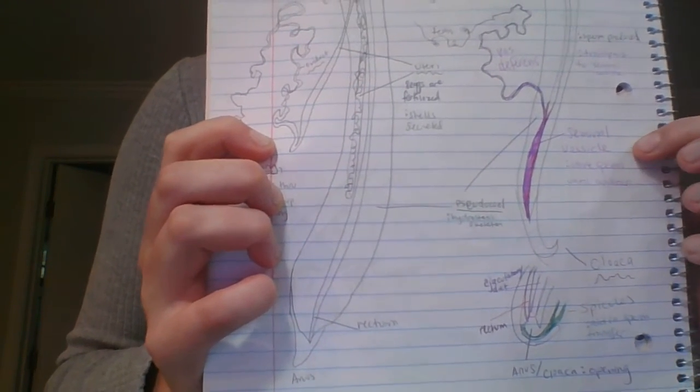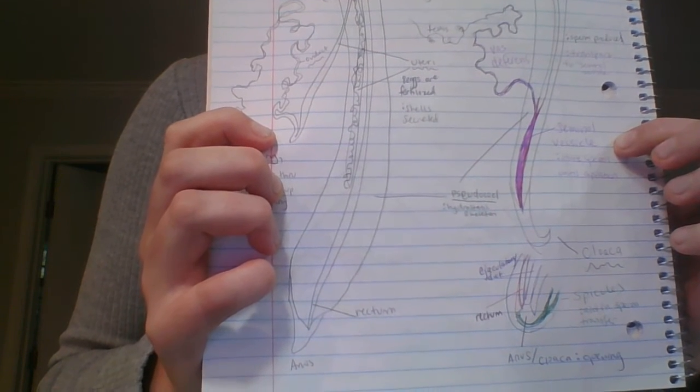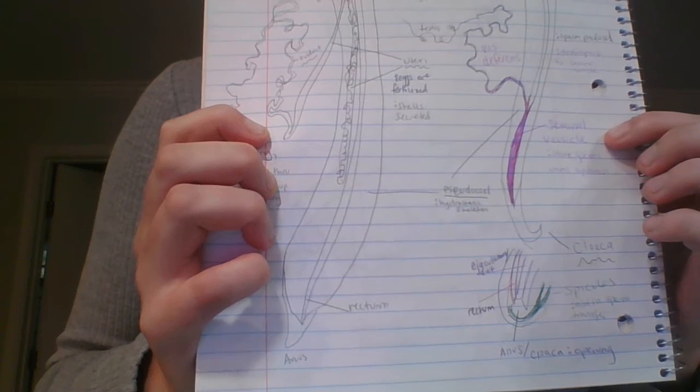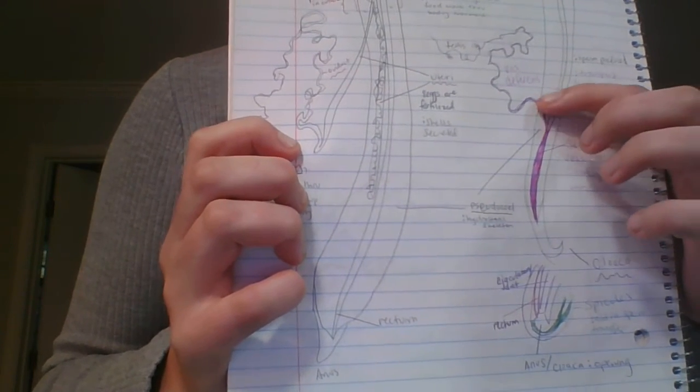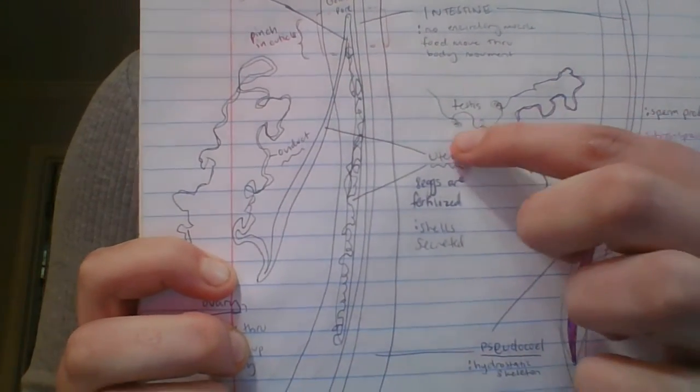But if we follow it up, this is the seminal vesicle. This is what stores the sperm, and then if we travel that up, the vas deferens. This is what transports the sperm from the testes, where it is created.